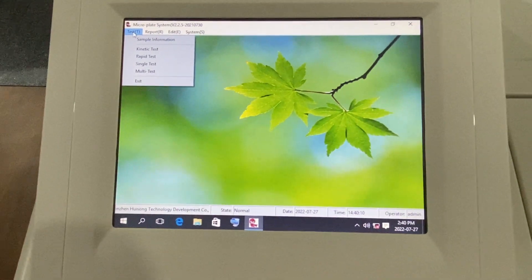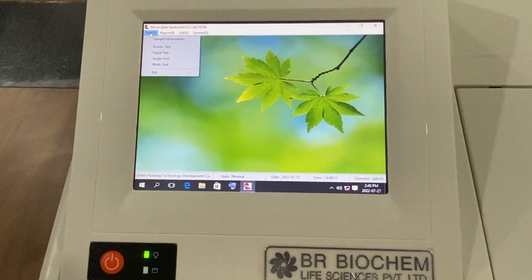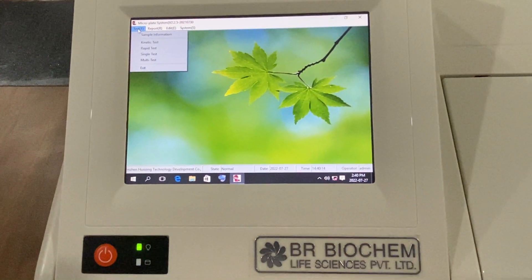In this ELISA reader, 4 USB ports are also available on the back side.